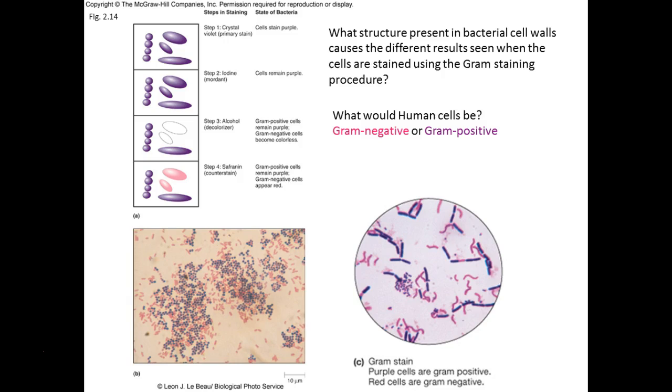Okay? So being purple and then getting stained red, again, you're only going to see purple because it's a much darker color. You can't flip this order because if you did red first and then purple, everything's going to be purple. You're not going to tell. You'd have to tell light purple from dark purple. That wouldn't be very fun, right? I'm telling you, even the pink and purple sometimes is hard to see.